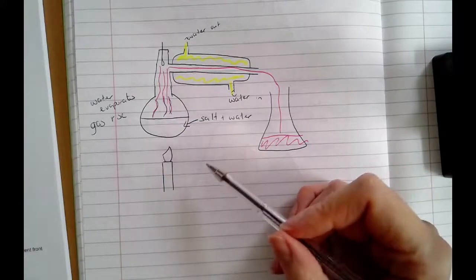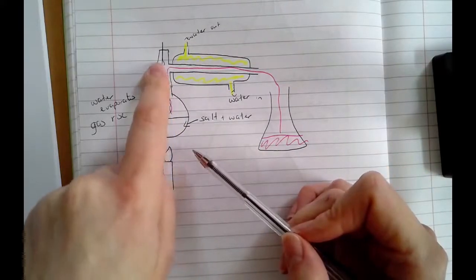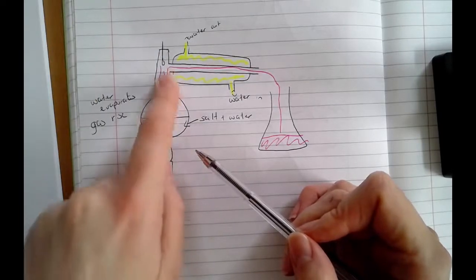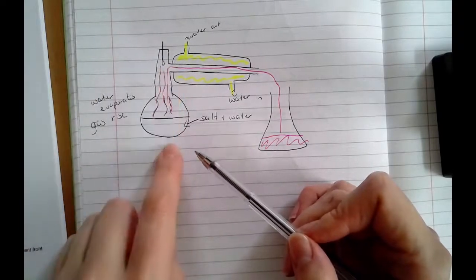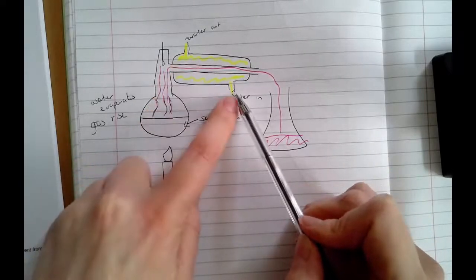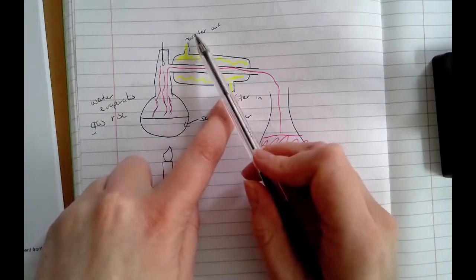Okay, and we'll come back to why in a second, but I've got a thermometer here, and the thermometer shouldn't be the whole way down in your round bottom flask. It should be just here, level with the condenser. With the condenser itself, the water goes in at the bottom and it goes out at the top.